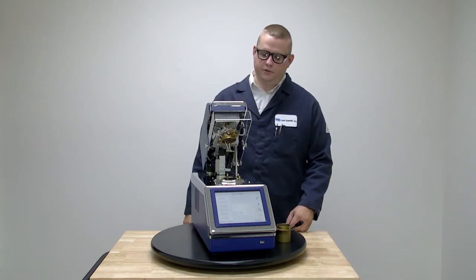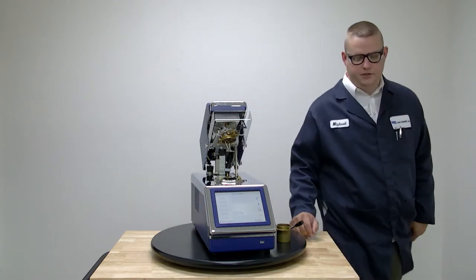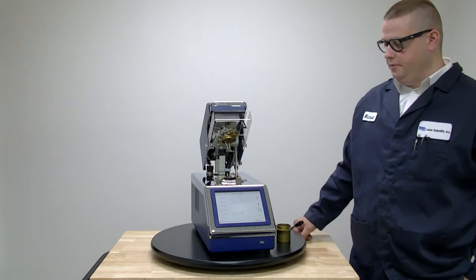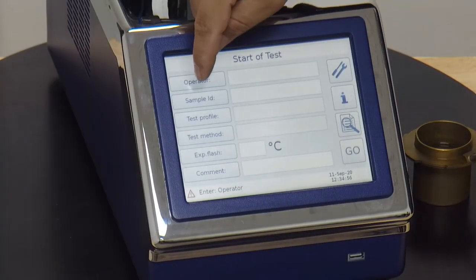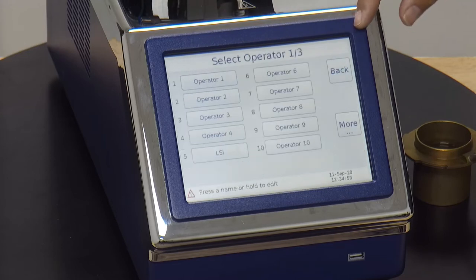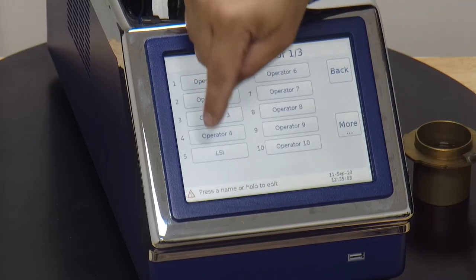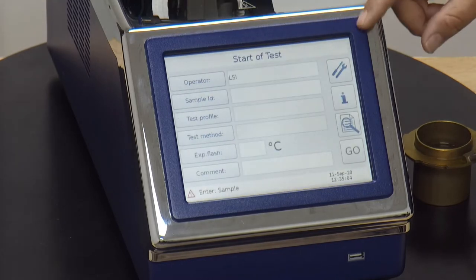Like any test on the Stanopceta Penske-Martin, we're going to work from the top of the screen down in order to get all our information in and run the test. First box is Operator. Here you can either type in a name or select from one of 30 pre-populated names. We already have LSI put in so we'll select that.